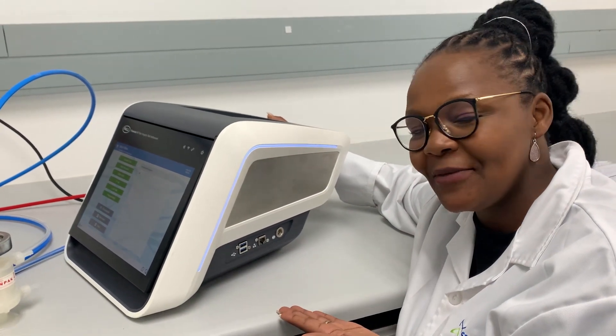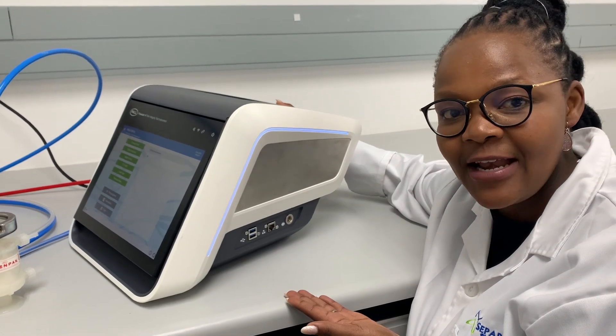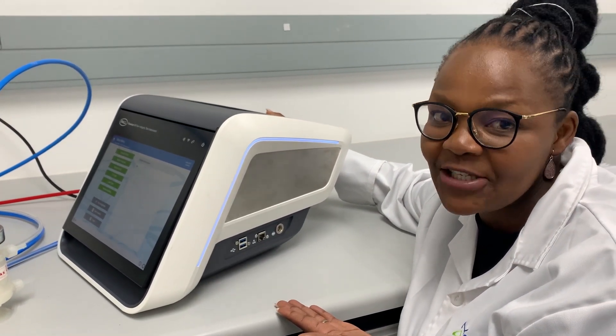If it's blue, it means the instrument is ready to be used. It will be red if there's an error, and it will be green if the filter integrity test has passed.